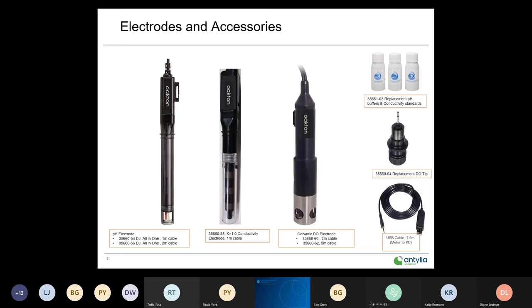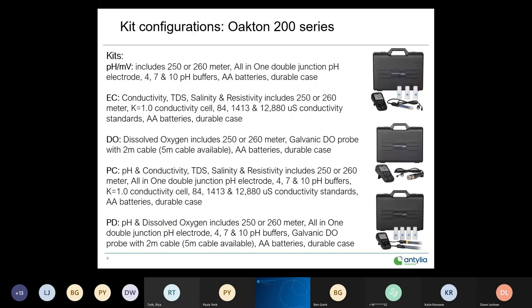There's also a USB cable for download, essential for the 260 meter. For the pH kit configuration, the pH and millivolt kit includes either a 250 or 260 meter, the all-in-one double junction pH electrode, 4, 7, and 10 pH buffers, two AA batteries, and a durable case.